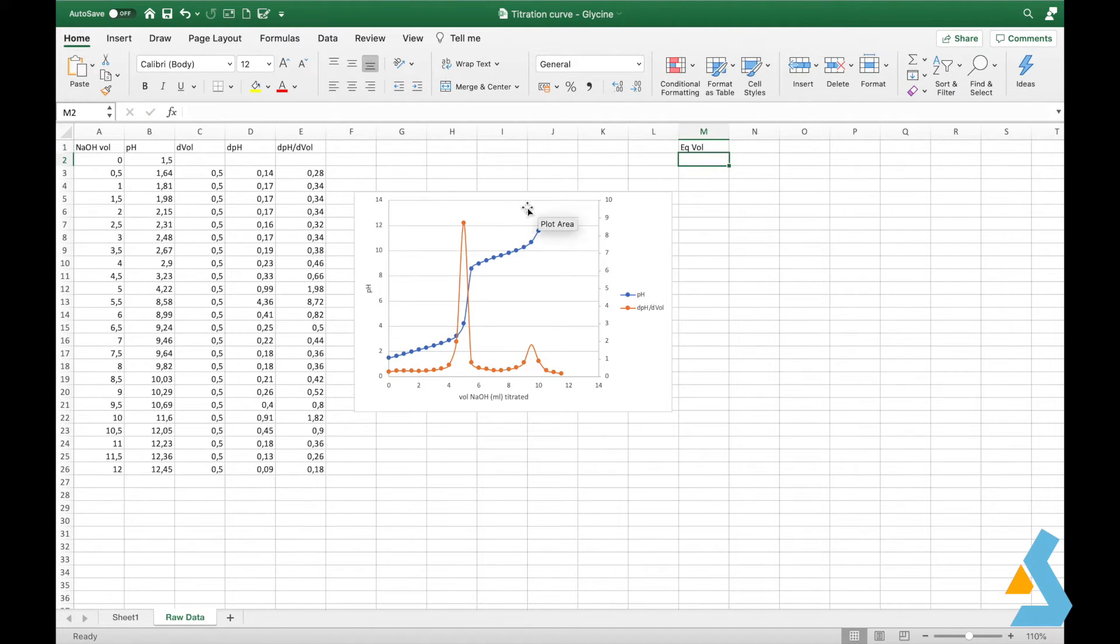Let's record the first one. First, let's name a new column. The x value of this first peak is 5, and the value for the other peak is 9.5.